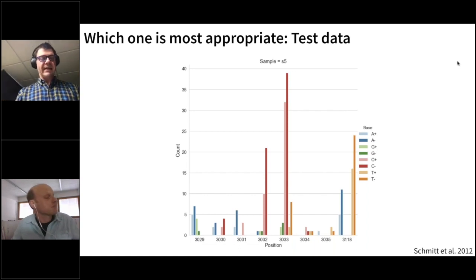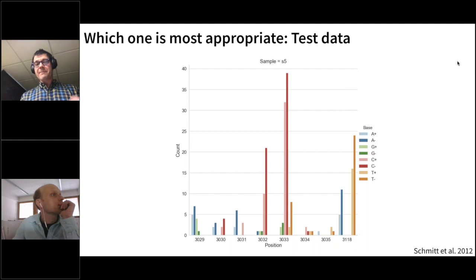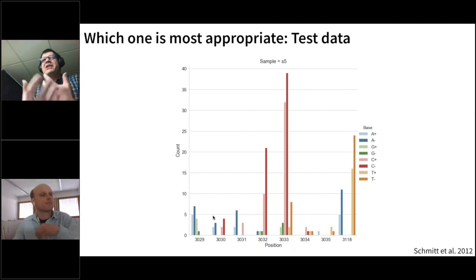So what we've done is we have taken a data set from our recent publication, and this publication is resequencing data for the pBR322 plasmid. And there is a series of sites. So in this graph, you have 8 sites. And these bars indicate counts of differences from the reference. You can see that the different colors here mean different bases because these sites are naturally multi-allelic.